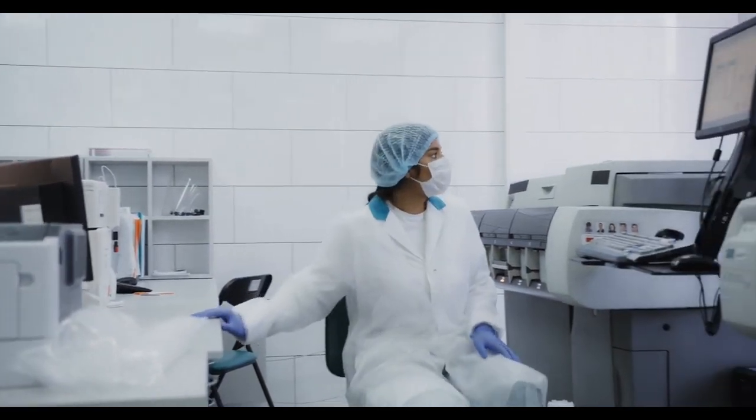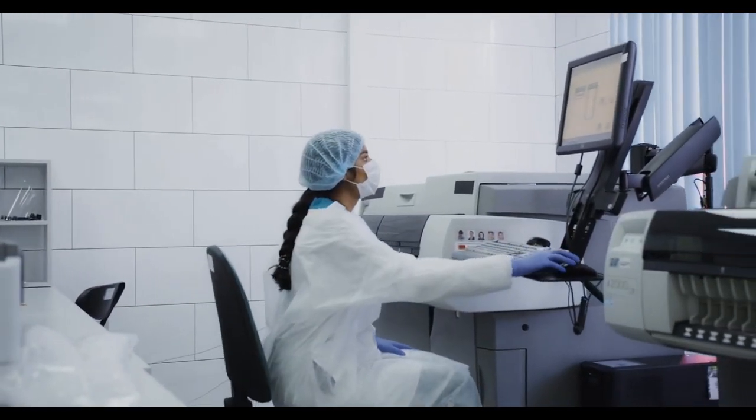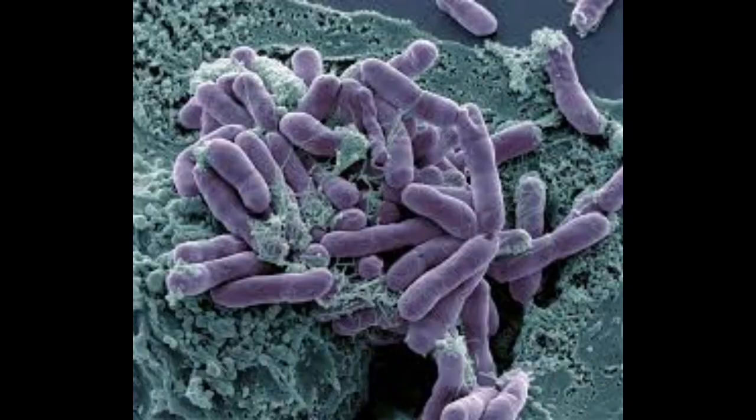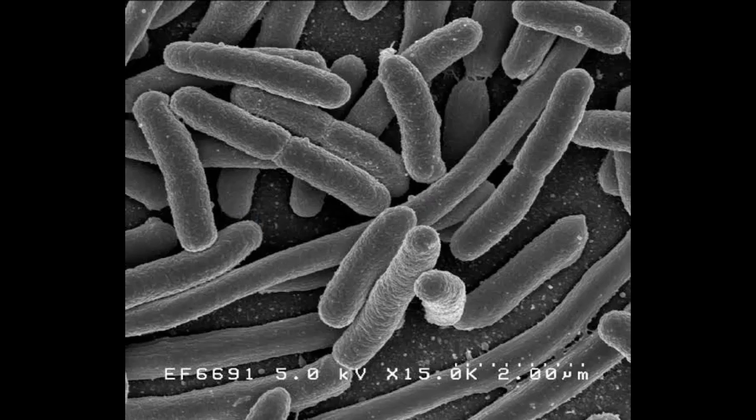or anyone working with bacteria is contamination. So in order to avoid contamination, you really need to keep the place clean. Contamination is a very big issue.